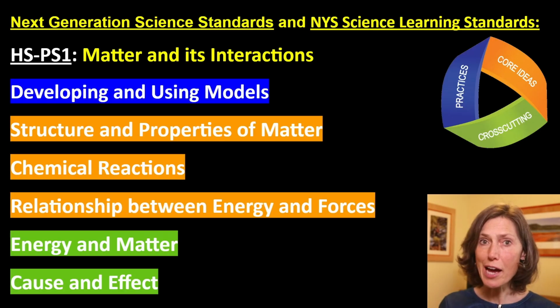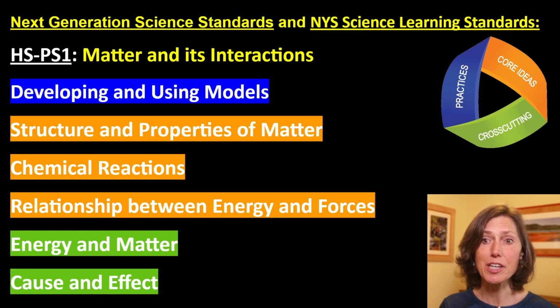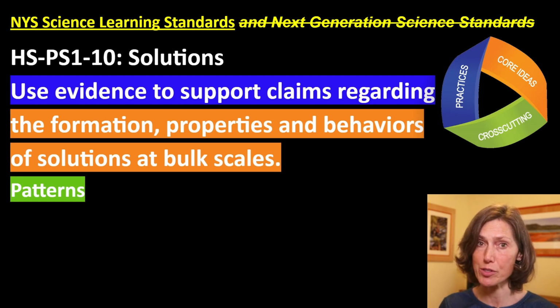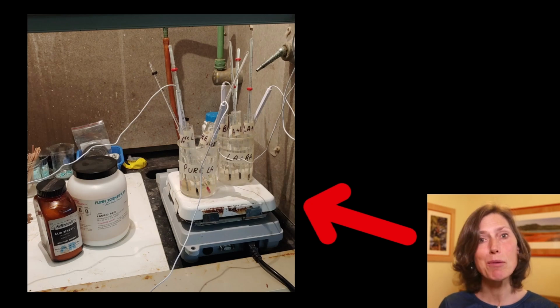This particular lab deals with the following NGSS standards and New York State Science Learning Standards, namely HS-PS1, matter and its interactions. And for those of you in New York State, it particularly addresses HS-PS1-10, solutions: use evidence to support claims regarding the formation, properties, and behaviors of solutions at bulk scales. Patterns. Here's a picture of my setup in my fume hood.